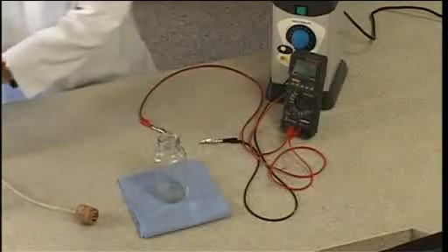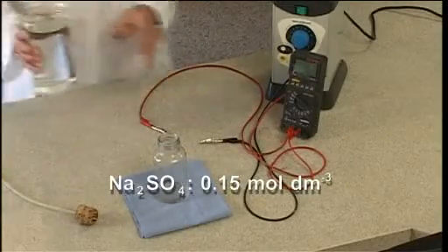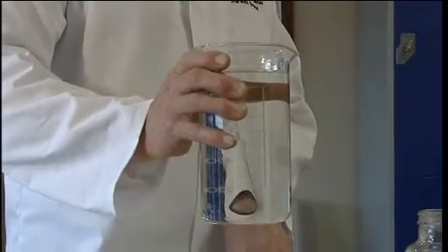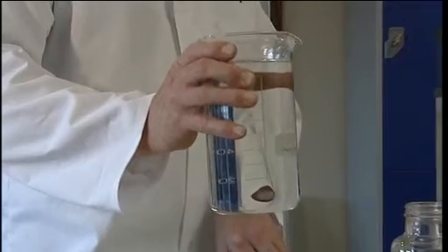This is an approximately 0.15 mole per cubic decimetre solution of sodium sulphate. We have to add a little sodium sulphate so the ions will make the water conduct.